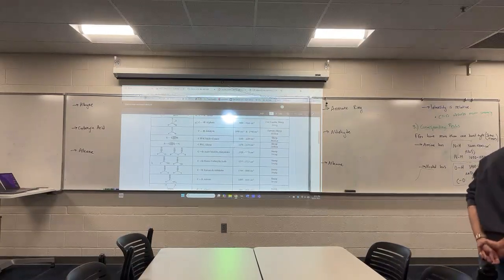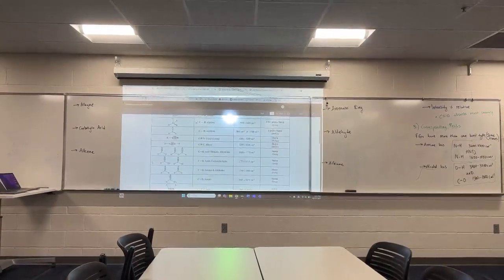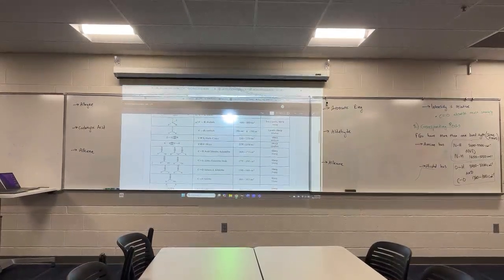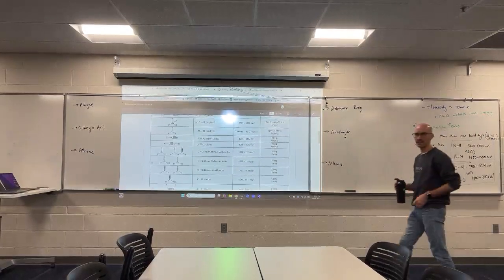We'll talk about that. It's a fun property of the ring. Because you'll notice the alkene doesn't have them, despite the alkene also having carbon-carbon double bonds. Yeah, isn't it? So what did you find out? Fermi resonance. Fermi's a famous guy.